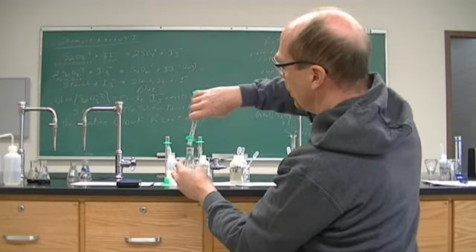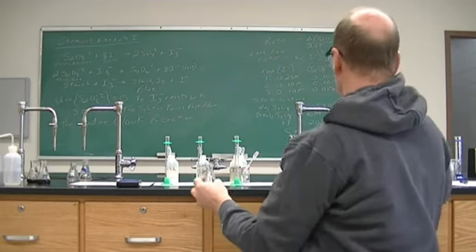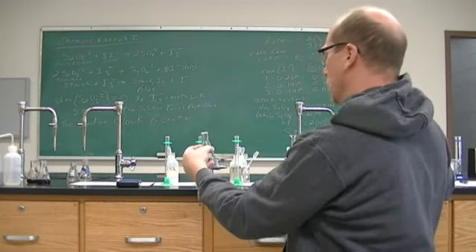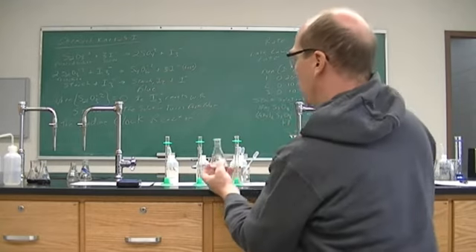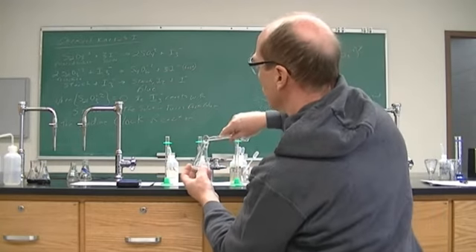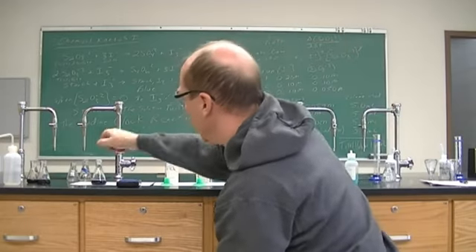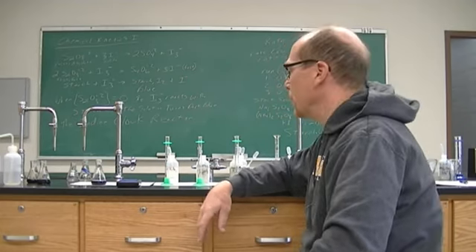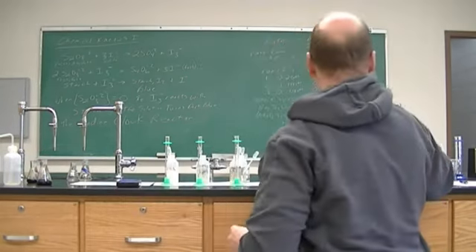Now before I add the S2O8, I'm going to add a drop or 2 of catalyst. All right, and so now when I pour this in, you see that it takes 2 seconds. All right, so the reaction is very, very fast. Let's try that again.